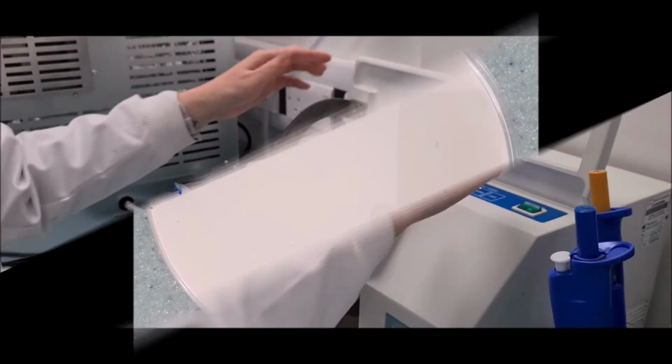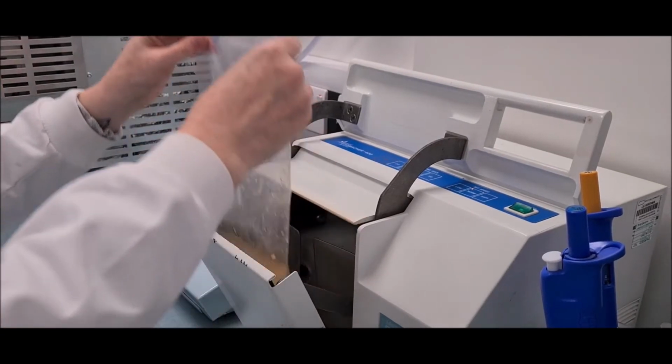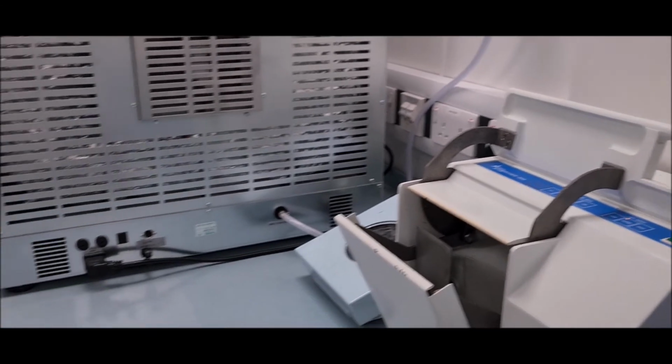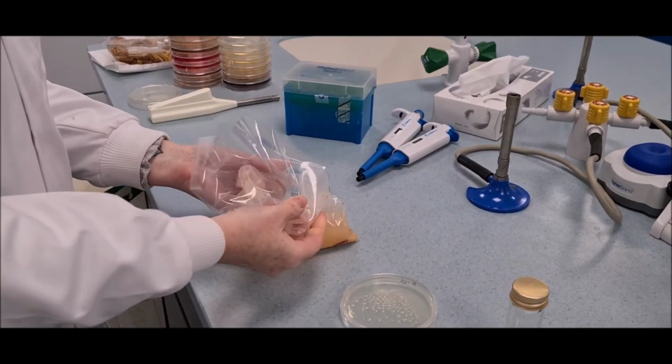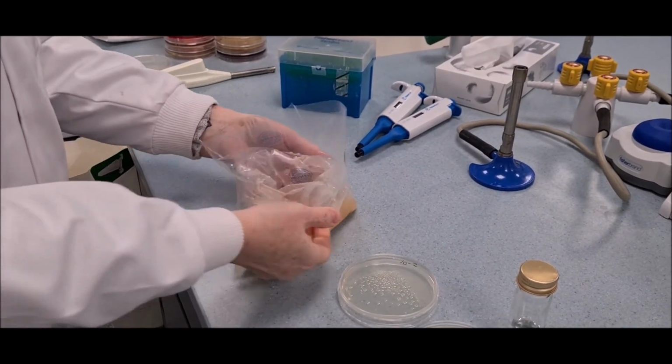In the next step, we have to perform a serial dilution using the stomached sample. Remember, this is our first dilution of 10 to the power minus 1. Set the bag with sample on the bench. Open it carefully, ensuring no extraneous contamination occurs to the inside.